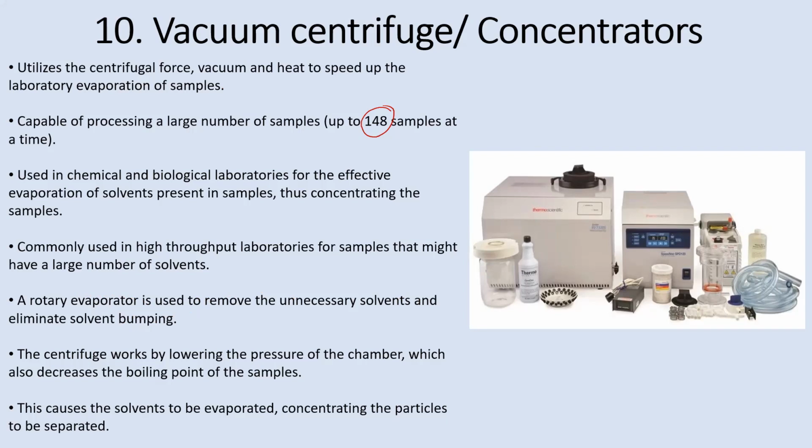And if that jumps out of the container, obviously there is going to be a spillage inside the equipment, but along with the solvent that will bump out, the biomolecules may also bump out, and that is not good. And if it's a big lab, there are many students working, and many students have the same kind of sample, but the biomolecule is different. So some are working on, say, A, and others on B and then C.